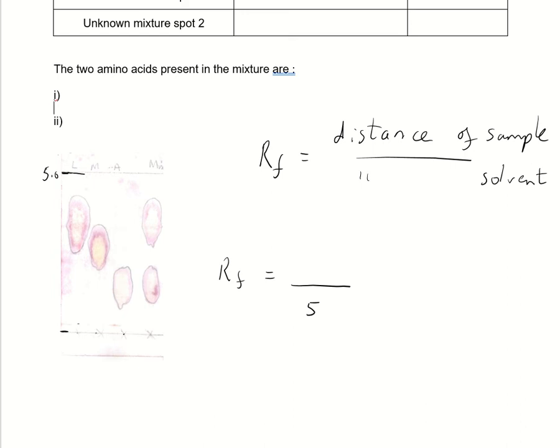Otherwise, if you end up with a big blob of your sample, it will smear out a bit like this. Generally, you want to go tap, tap, tap on there a few times so it's concentrated but at a sharp point, and that'll give you smaller dots on this. But it doesn't matter as long as we can clearly see them.